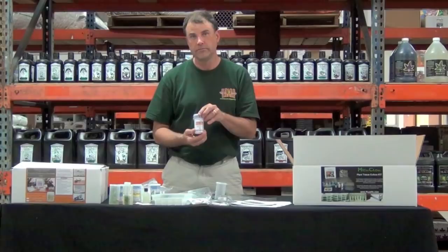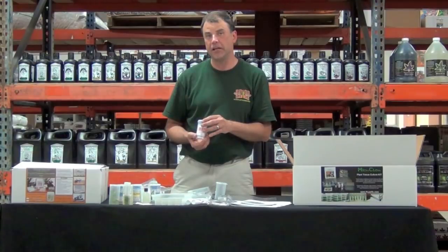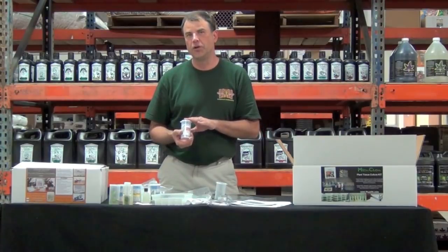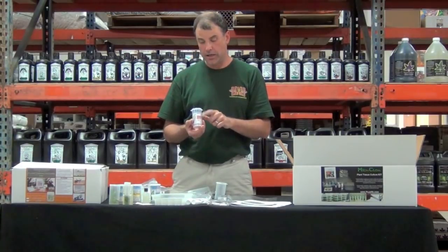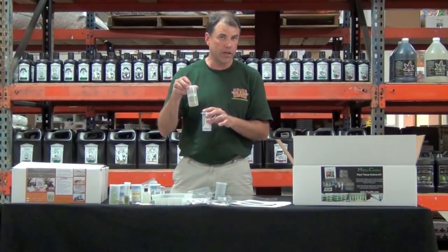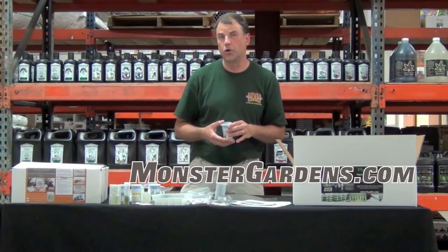Lastly, there is the root kit — sort of self-explanatory. When you have grown and multiplied as many plants as you wish in tissue culture, the following month you're going to have three or four times as many plants. This is usually when you're going to start taking plants out of culture and putting them into regular plug trays — the rooting stage. This gives you the opportunity to do pre-rooting of your one-inch or three-quarter-inch tissue culture plants in tissue culture, so we make up the exact same vessel with a rooting medium. The plants will be able to double in size, begin to grow roots, and those will be the plants you take out for planting into plug trays.